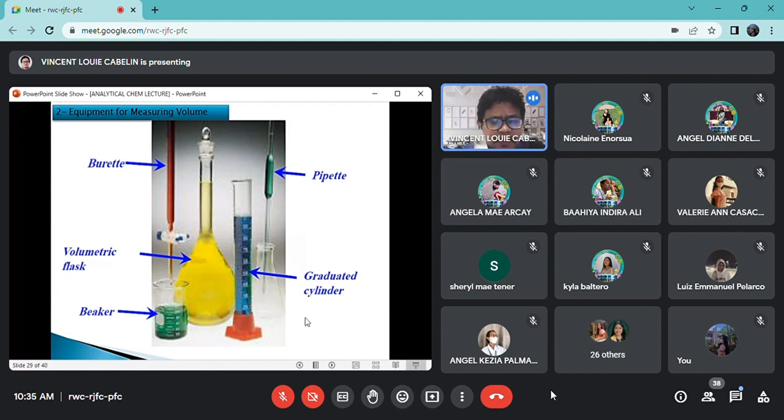Okay, you have volumetric flasks. The difference between any flask and a volumetric flask is that in a volumetric flask, usually the bottom part is round in shape, so that it could house more volume. At the same time, if you're heating the flask, the round bottom will also help dissipate the heat much more evenly throughout the flask. We have Erlenmeyer flasks also that also have graduation.